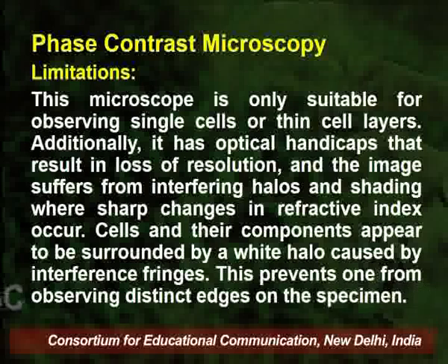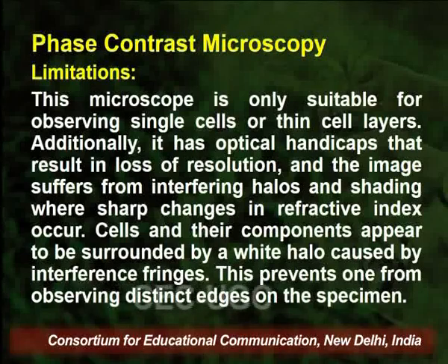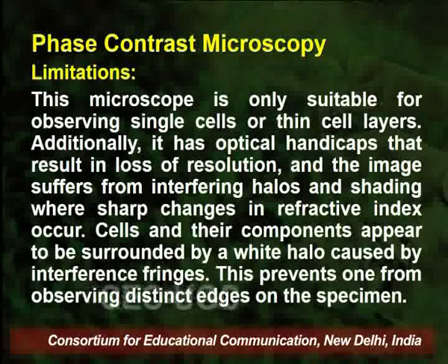As far as the limitations of phase contrast microscopy are concerned, this microscope is only suitable for observing single cells or thin cell layers. Additionally, it has optical handicaps that result in loss of resolution, and the image suffers from interfering halos and shading where sharp changes in refractive index occur. Cells and their components appear to be surrounded by a white halo caused by interference fringes, which prevents observing distinct edges of the specimen. To overcome these limitations, we can use different variations of the light microscope.